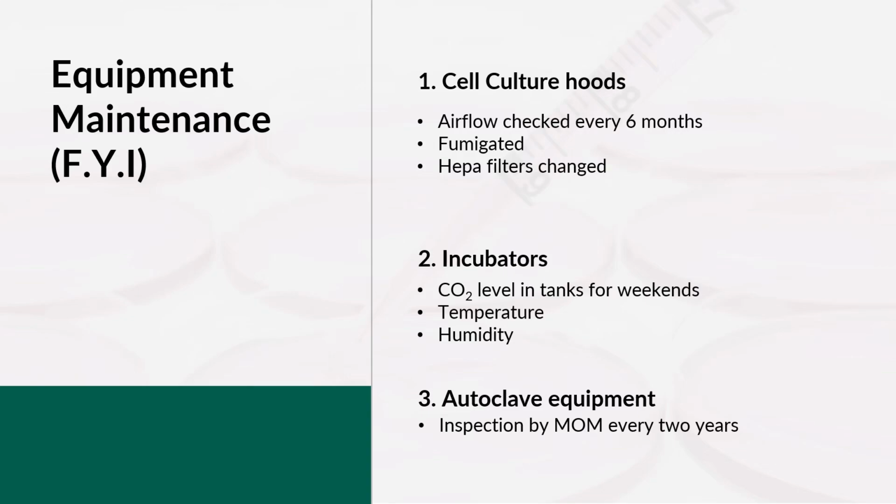Second is the incubators. The incubator chamber is designed in such a way to minimize the risk of contamination. So the design is really pretty unique. Ideally, there will always be a smooth inner casing and the shelves can be easily removed to allow cleaning and disinfection. Many manufacturers offer incubators that have a copper interior and shelving, or the modern ones even have automatic decontamination routines, which you can use in order to reduce the risk of contamination in the incubator itself.